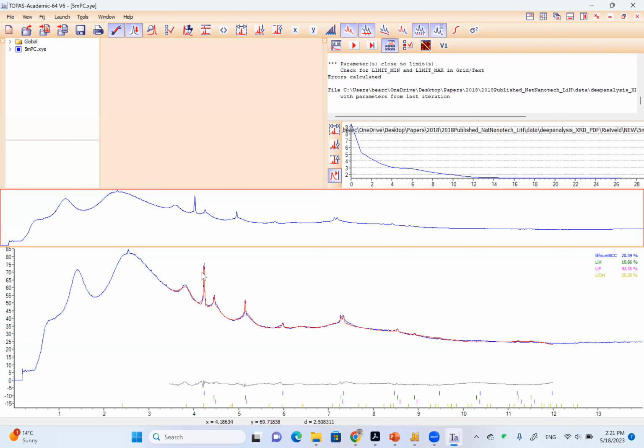And also the background should be carefully taken. Okay, the background is a must for interface measurements, even for XRD. We must measure the background very carefully. So that's something you need to pay attention to in terms of taking the data. And the second step is also challenging, and that's why we're having this lecture, which is analyzing the data. So how to analyze such a pattern?